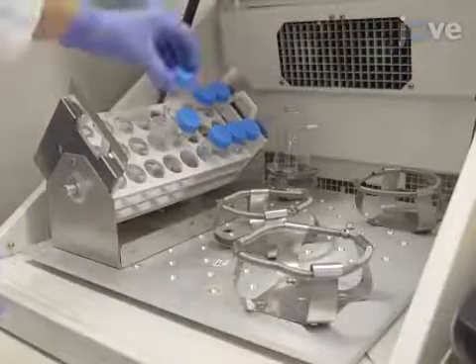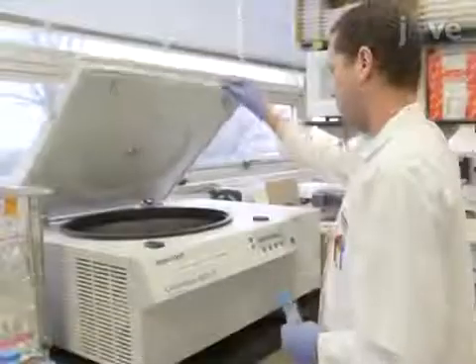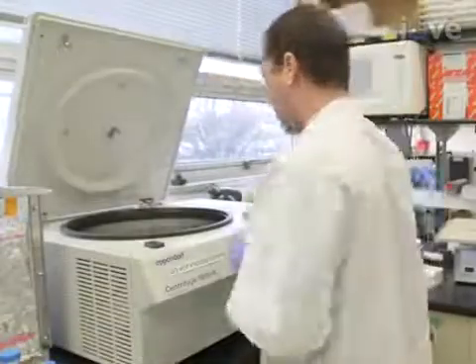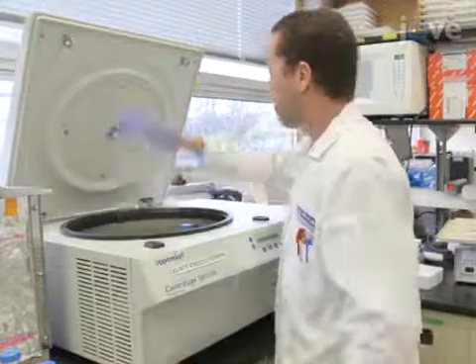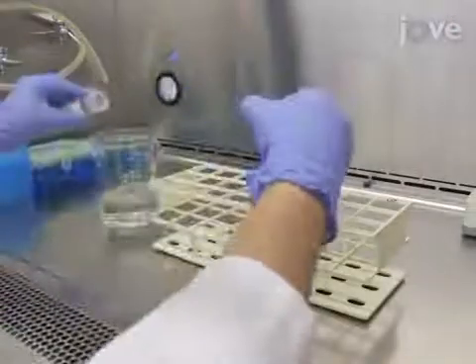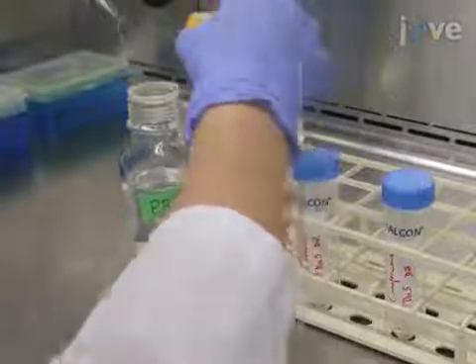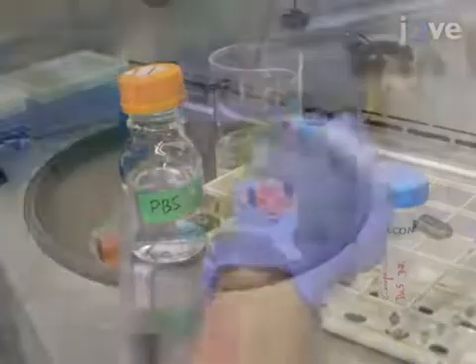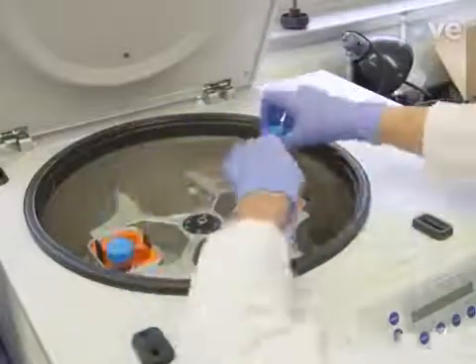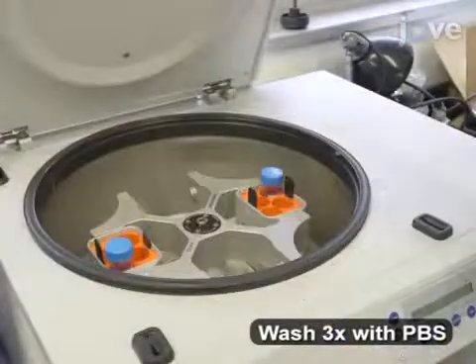Begin this procedure by growing the fungal strains for the assay as described in the text protocol. On the following day, collect the cells by centrifuging the conical tubes at 1200 g for five minutes at room temperature. Discard the supernatant, add 10 milliliters of PBS to each tube, and re-suspend the cells. Centrifuge again at 1200 g for five minutes at room temperature. Repeat the PBS wash and centrifugation two more times.